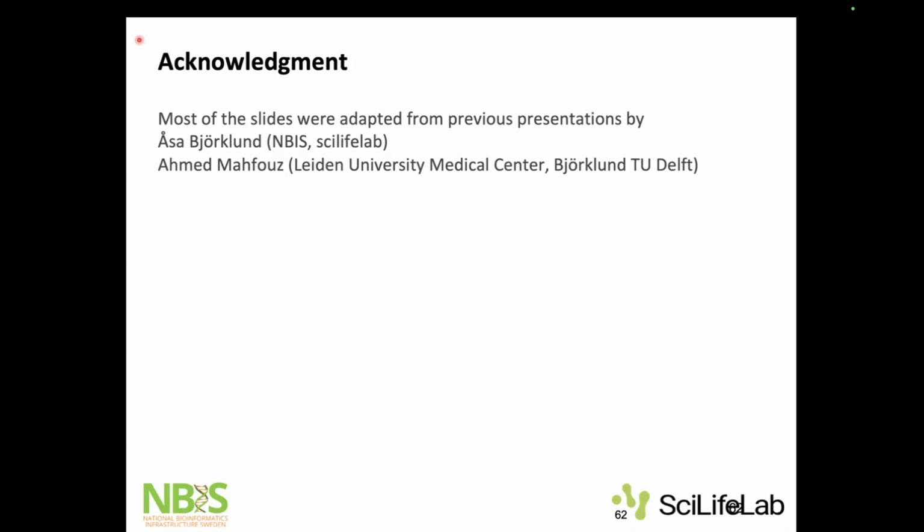It depends on the method. Some of them project the data you are testing onto the other data set, integrate it first, and then transfer the label. So technically, if any of the cells from the new data set group with those cell types, they will most likely get that label. So it depends on the algorithm that you are using as well. And in this case, I can use different algorithms to test how they do label transferring? Yes, yes.